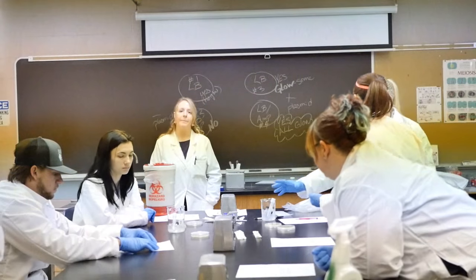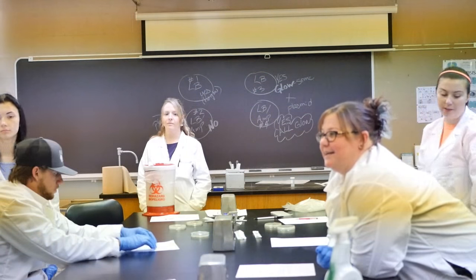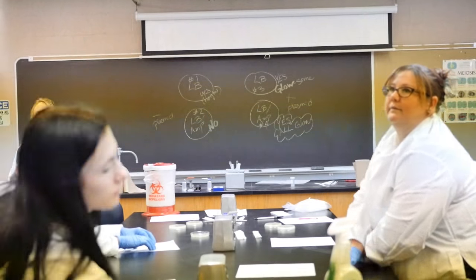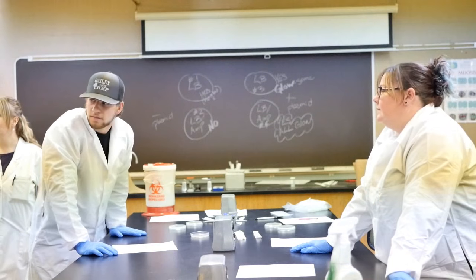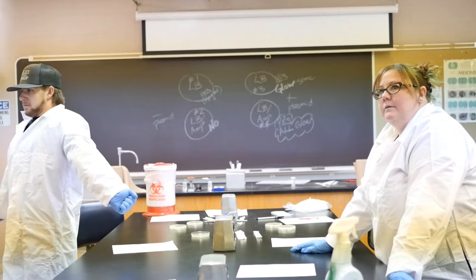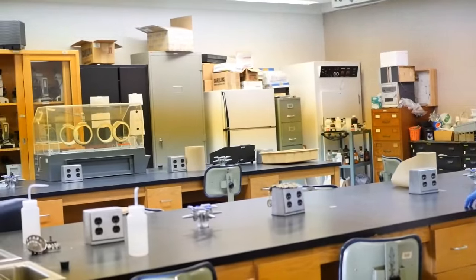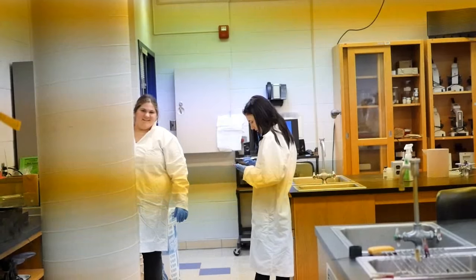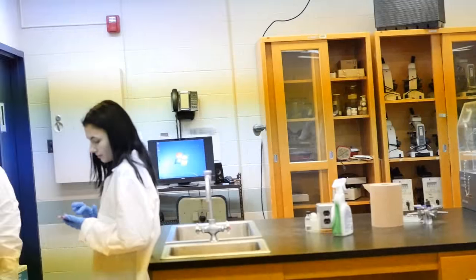I want to see how you do the agitation. Well, I've got to watch the clock. Okay, just let us know when. Make sure it's at 42 degrees Celsius before you stick it in there. Is it still at 42? Yes, ma'am. Alrighty. We're waiting on you. I have a stopwatch. Okay, go.